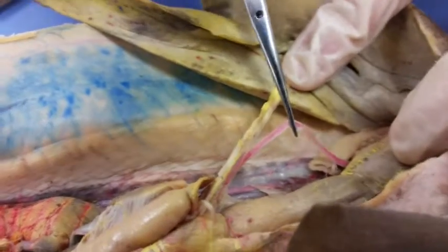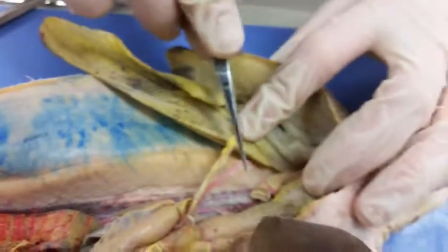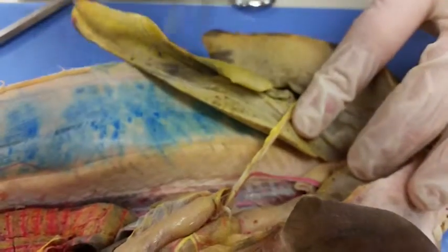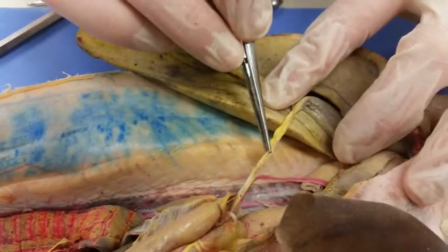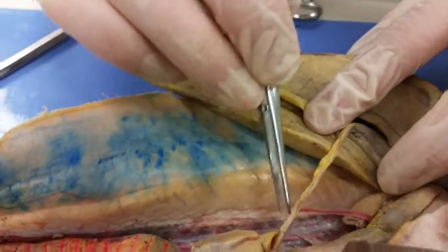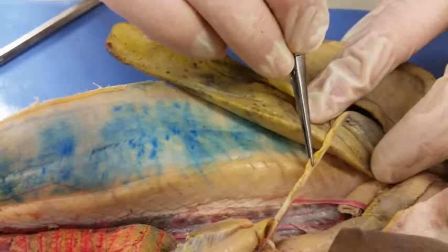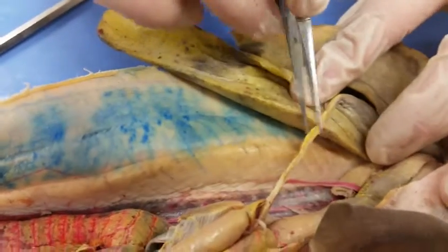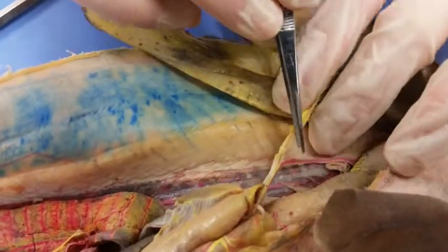We have the celiac artery here. Pairing with that is going to be the pancreatico-mesenteric artery, which runs right next to the hepatic portal veins, which are going to be running along right next to it. So this yellow area, you can barely see a red area. That is the pancreatico-mesenteric artery, celiac artery.